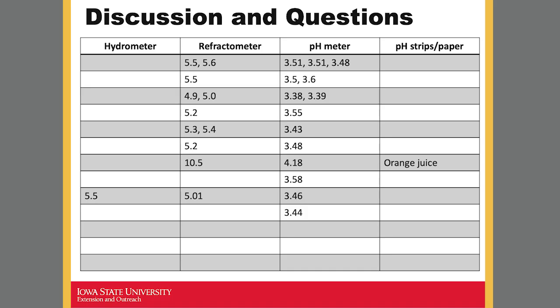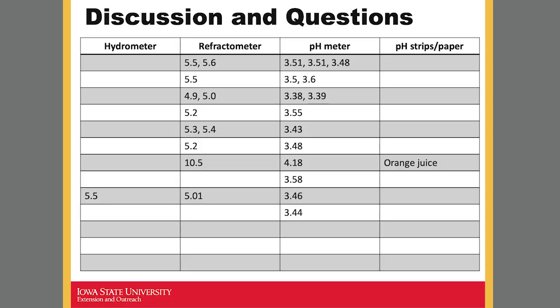So that's 5.5 grams per 100 milliliters. And these pouches are 200 milliliters. For orange juice, if you have the facts label there, does it match the carbohydrate content? And we can talk about conversions too, if it gives you a value, because it's going to be per serving, it might not be exactly the percent value that you got.